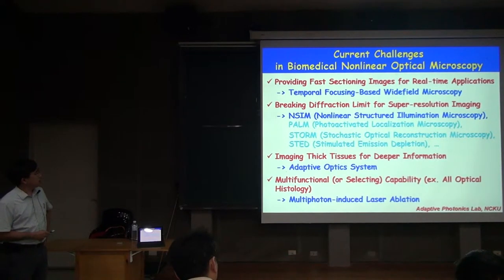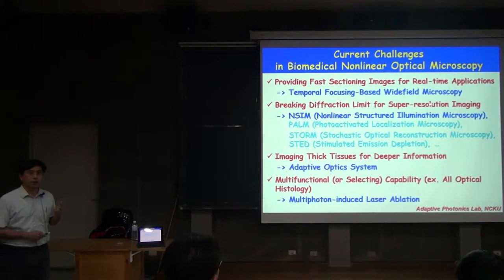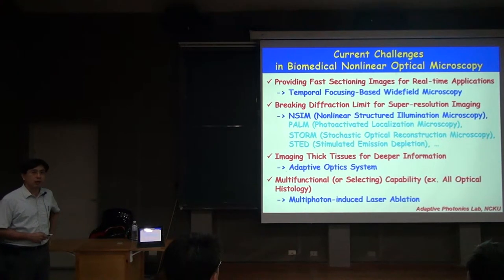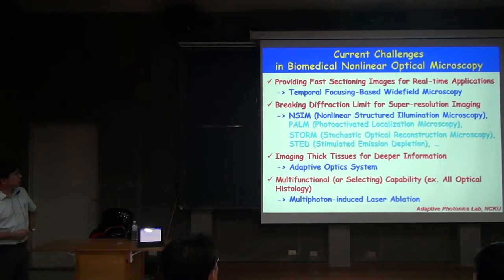Also for the resolution, we know the Abbe diffraction limit. So usually the resolution is limited by lambda over 2. Here I will focus on and show the nonlinear structured illumination microscope for how to break the diffraction limit.